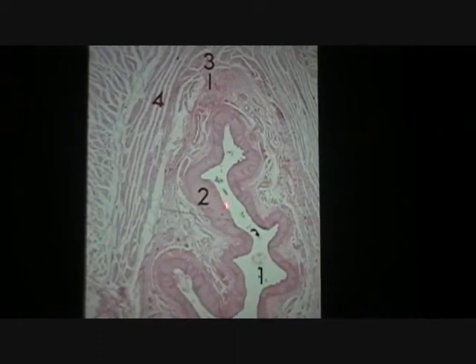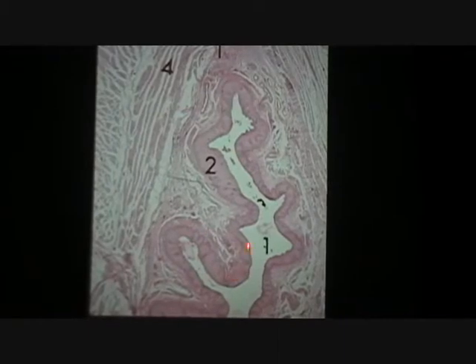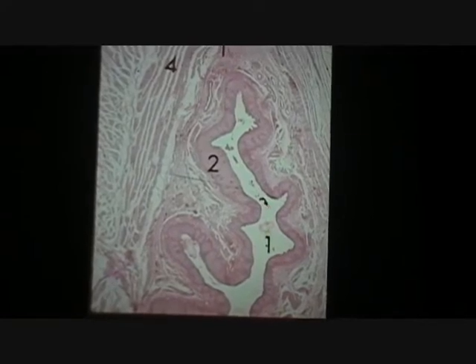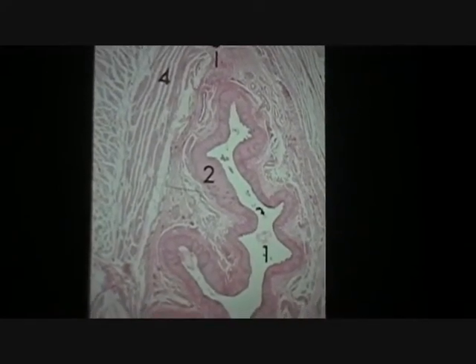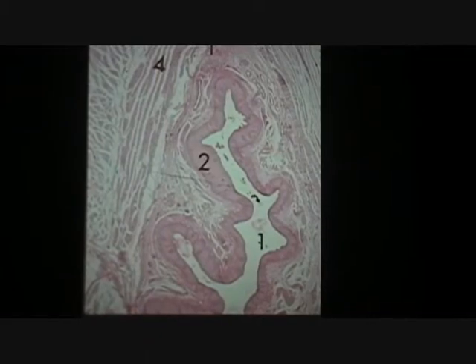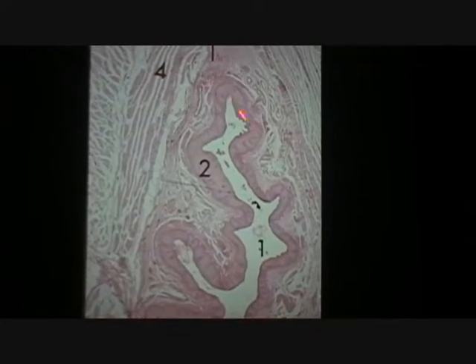Yeah, this is that stratified squamous layer of esophagus. Human esophagus, so you can't get it all on the same slide. It's an example of what I call subtracting the histology. Seeing what's not there to then tell you, yeah, this has got to be the luminal aspect of esophagus.